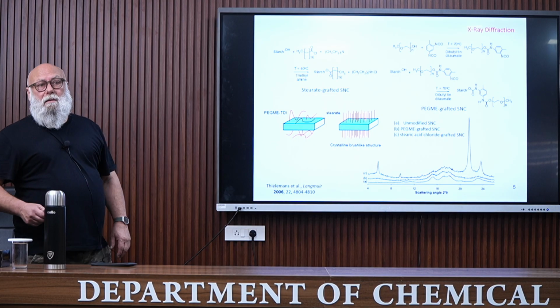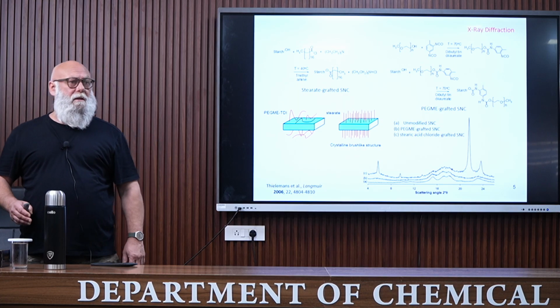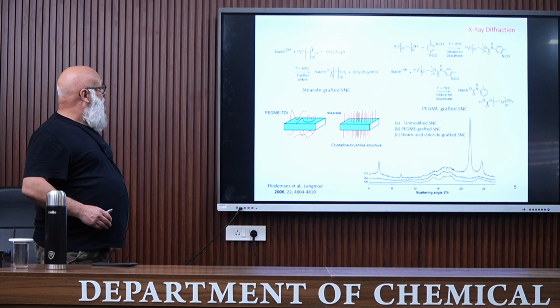In some cases, it's possible to see a new signal by X-ray diffraction, which is the case here.